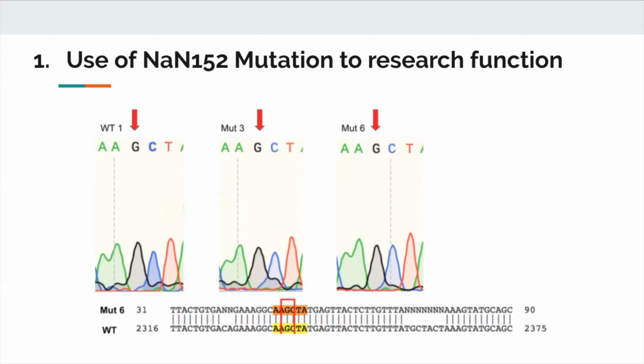As this is a homozygous mutation, we expected all mutants to show homozygous sequence results. Unfortunately, our gene sequencing was inconclusive due to cross-contamination or possibly due to low DNA concentration after purification. The Tuesday-Thursday section had inconclusive results as well when sequencing the same gene as us, and there was no data from previous years to confirm the presence of our expected mutation.